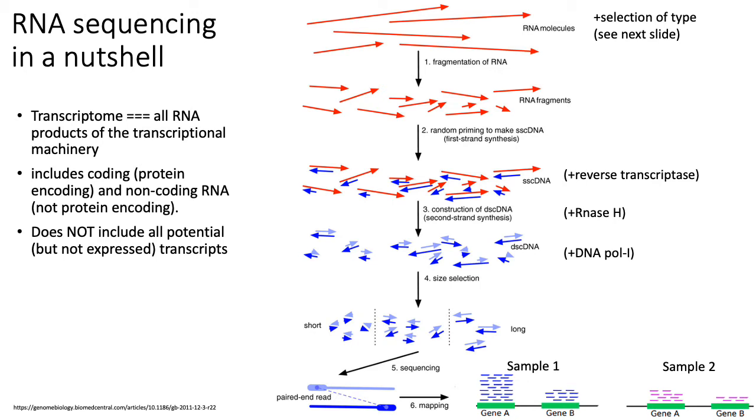And then in a differential gene expression test, for example, you could compare the number of reads that map to a given gene across different samples from either cases and controls, and then test whether or not a given gene is significantly differentially expressed in your cases versus your controls.